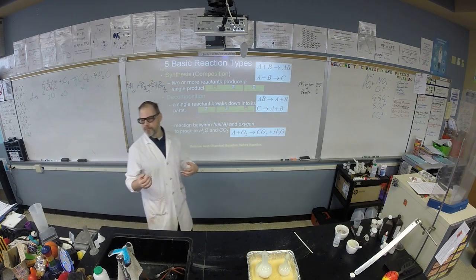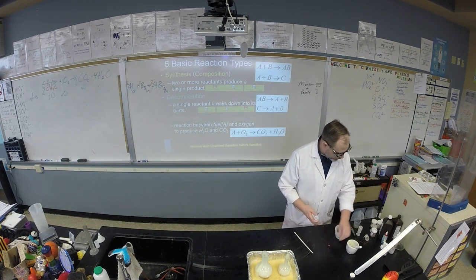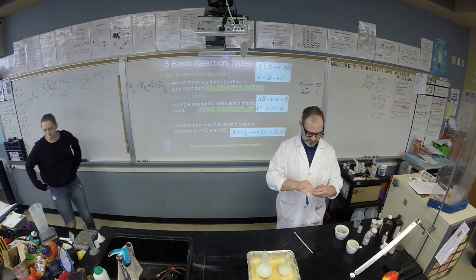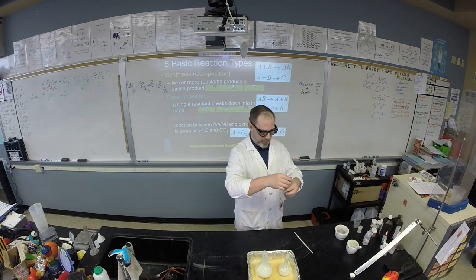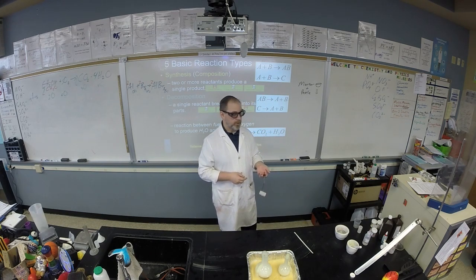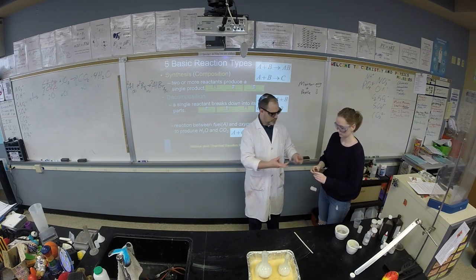Bradley, come up here. Are you scared of fire? Do you want to be a volunteer? Come on up and grab some glasses. I'm going to put a little methanol in this little container. Just a tiny bit. Just a few drops. So grab yourself some glasses over there. And this is just a barbecue sparker. You'll probably figure out what a barbecue sparker does. It makes sparks, right? All you need to do is hold the sparker like this in your fingers and then push down on the trigger. Like this.